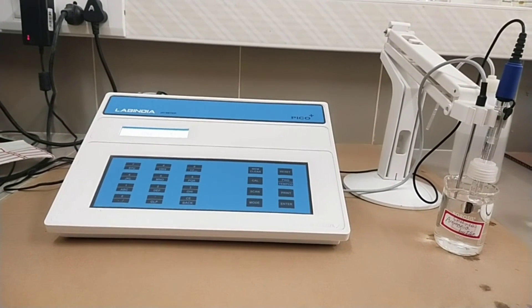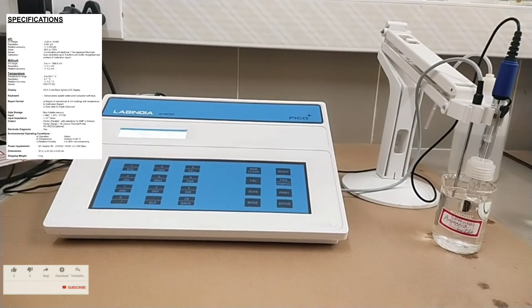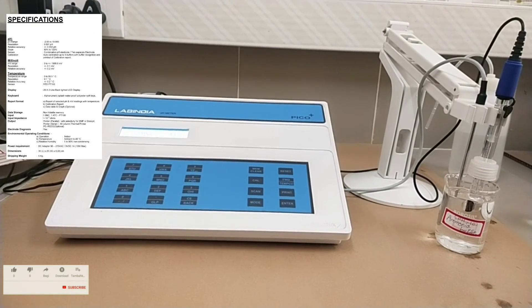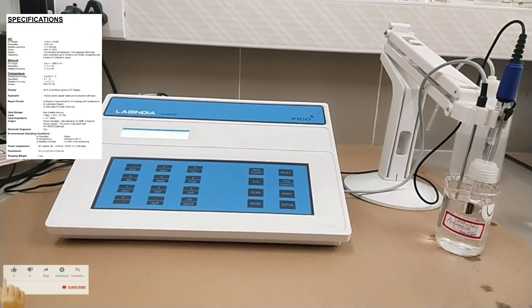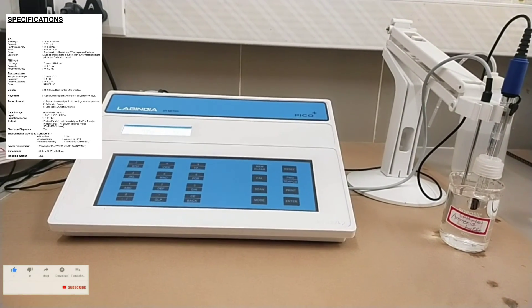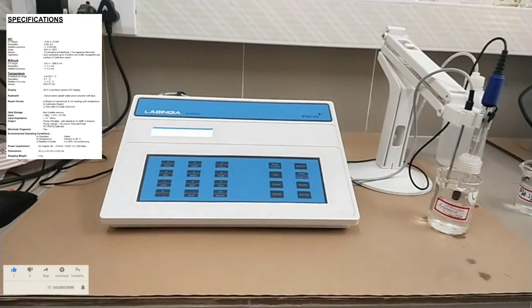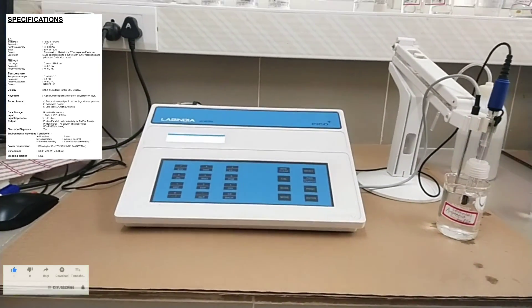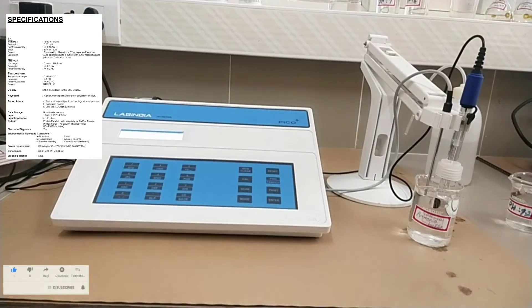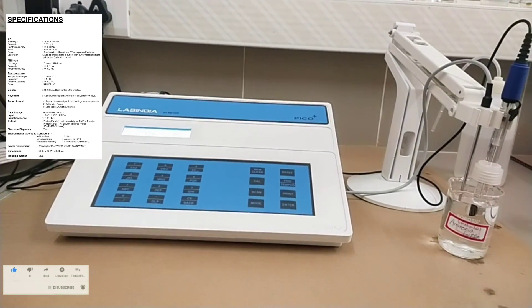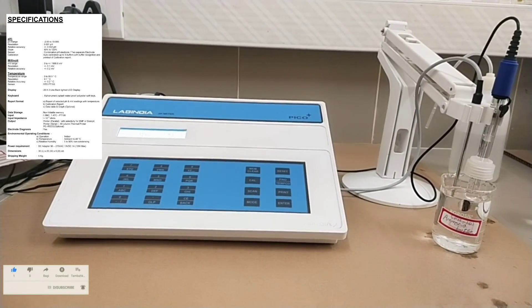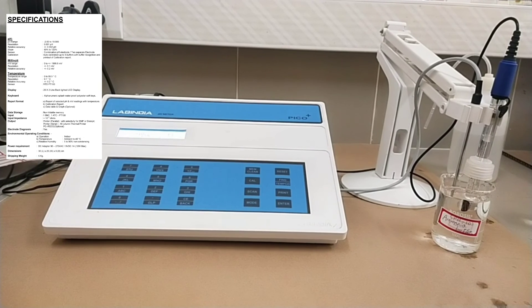The pH meter is an electronic equipment used to test the quality of municipal drinking water, environmental samples, waste water, soil analysis. Also used to measure the pH value of solutions in agrochemical and pharmaceutical industries.